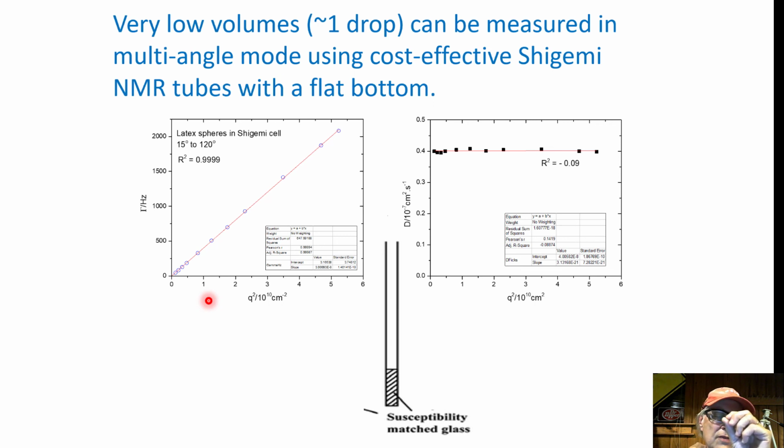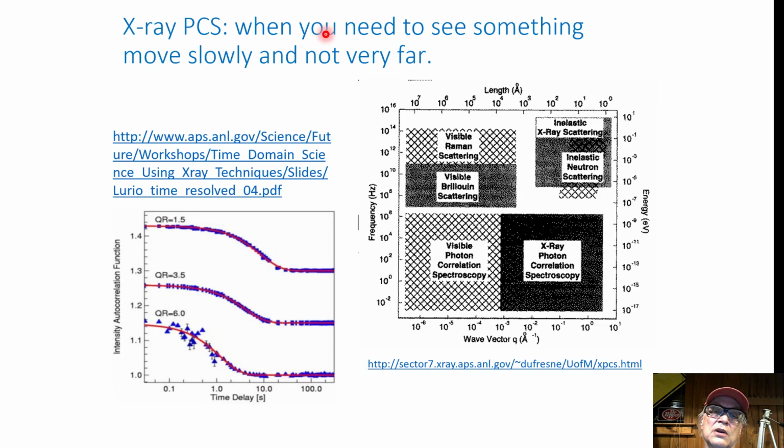But usually you don't have them in great quantity. So we were approached by a guy at a medical school who said, we got this Nature paper, and the reviewer said we needed to do it at multiple scattering angles. They don't believe our single angle DLS, and we heard you were good at this, so could you help us? So we did. We did this really simple experiment for these guys, and that paper's been cited more than 1,000 times in 10 years. Almost every week it gets another citation. It's really remarkable. So you can use very small volumes, is the point.